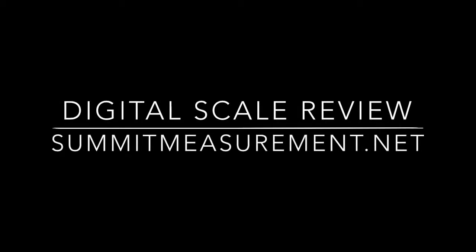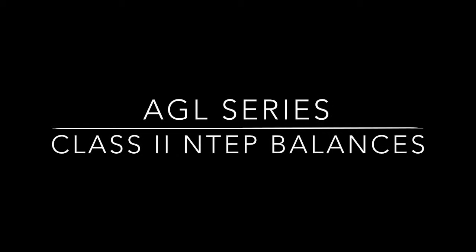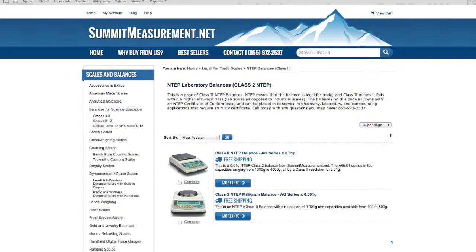Welcome to another 60-second review from SummitMeasurement.net. This time, the AGL series of Class II Intep balances.